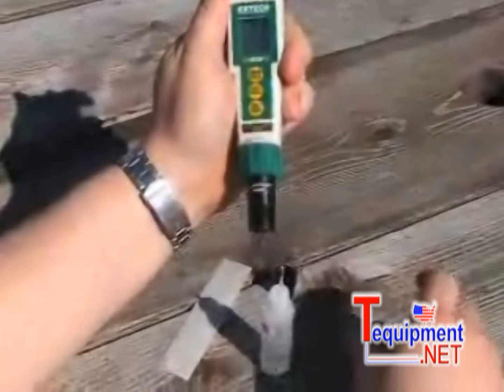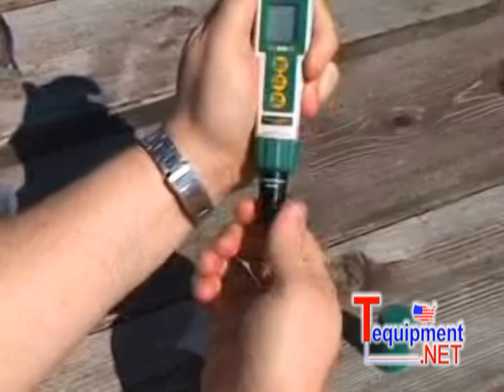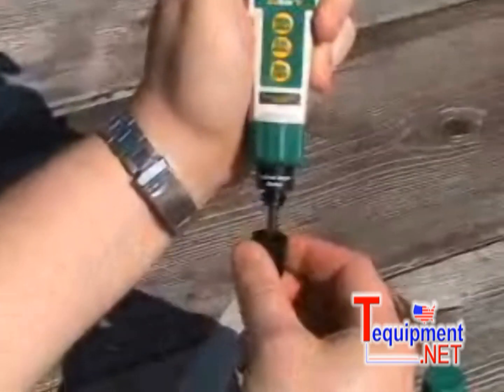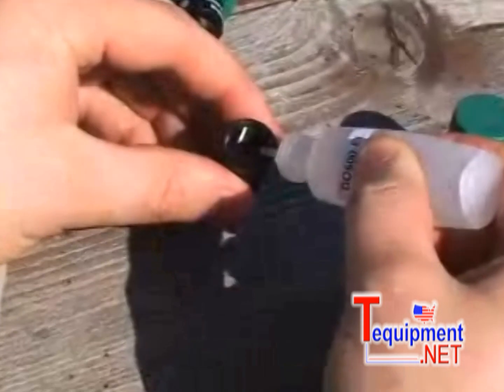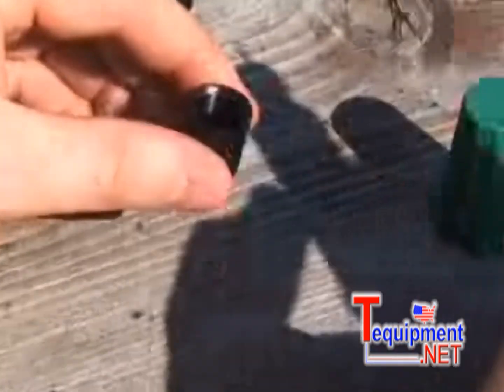A spare membrane cap and bottle of filling solution are included with the meter. When the membrane cap needs a replacement, you simply unscrew the old cap, polish the cathode, and then rinse with water. Fill the new membrane cap with filling solution and screw it on the sensor tip.